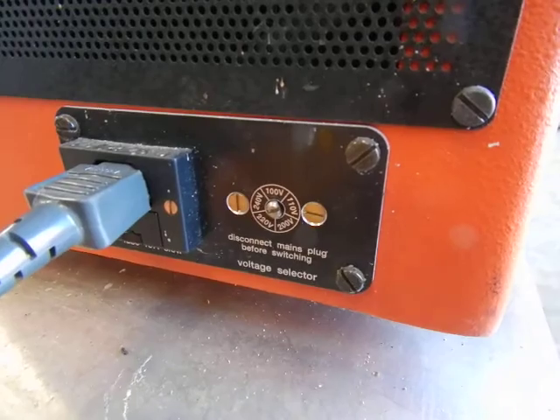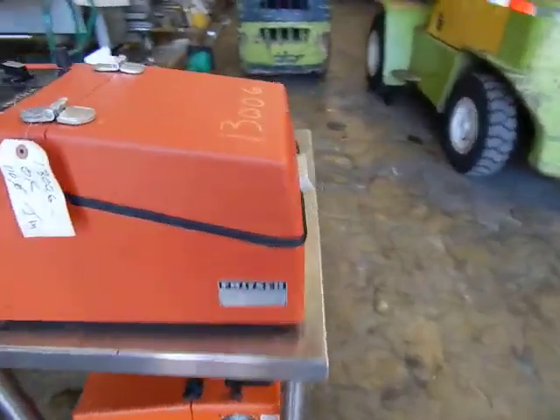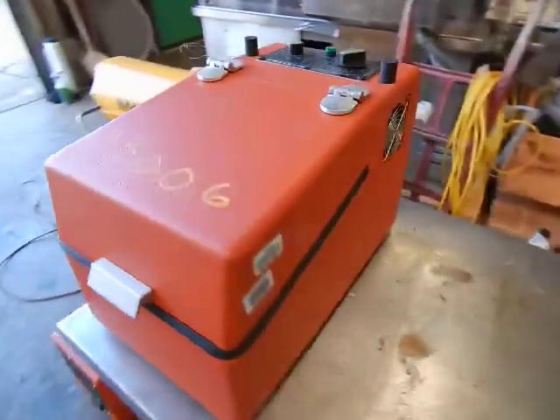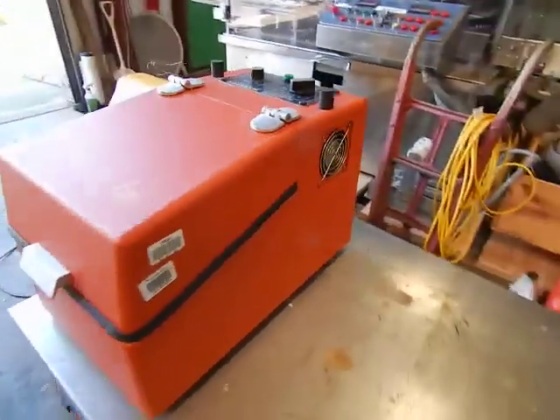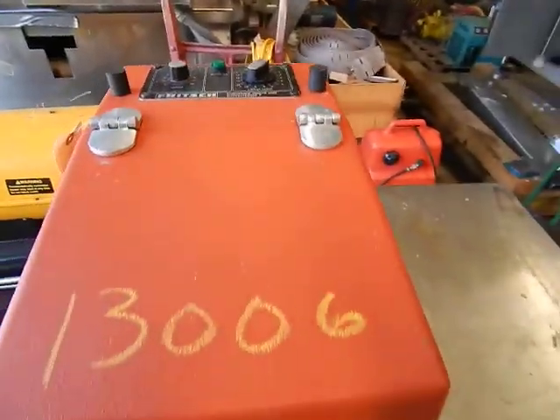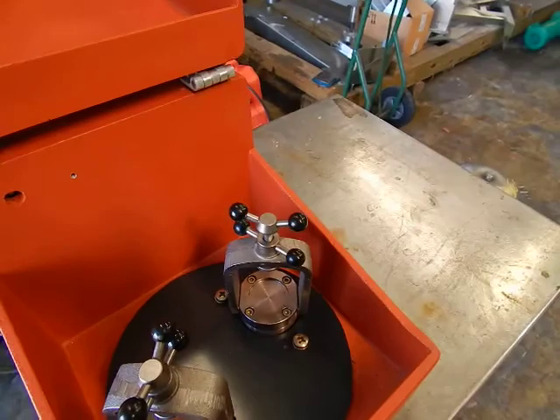Let's go to the back of the unit. At the rear, you'll see it operates on various voltages — probably single phase, both 110 or 220. There's a fan over here to keep everything cool inside.